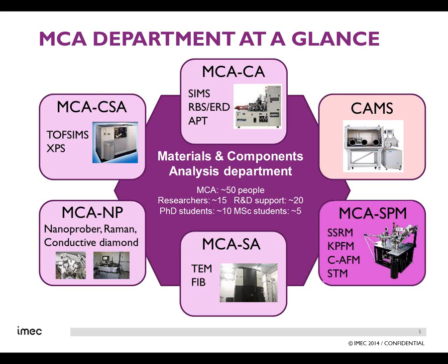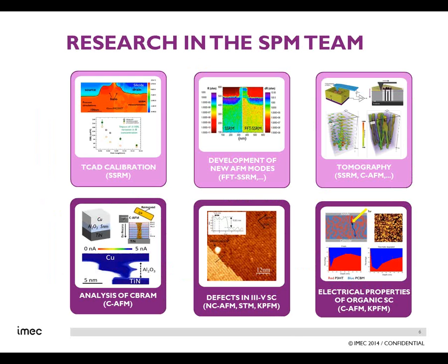As you can see, this department is composed of 5 teams, and also one spin-in named CAMS, which is basically making commercial use of the AFM research that we have done here, be it AFM service or the diamond probes that were mentioned by Peter, or dedicated test structures that were shown also. That's the team I'm leading, this SPM team, and basically we are doing a relatively broad variety of different research. I will partially cover some of them during this talk.